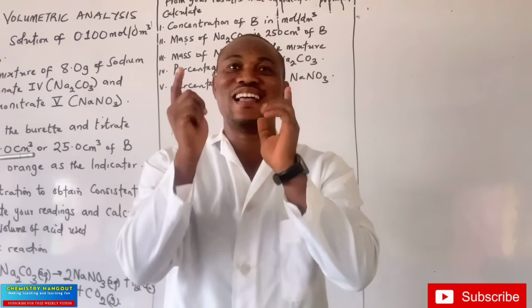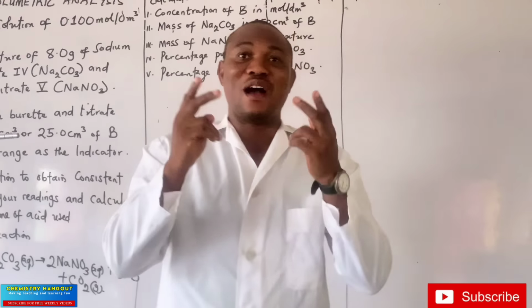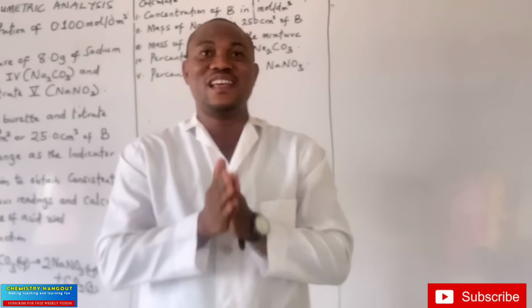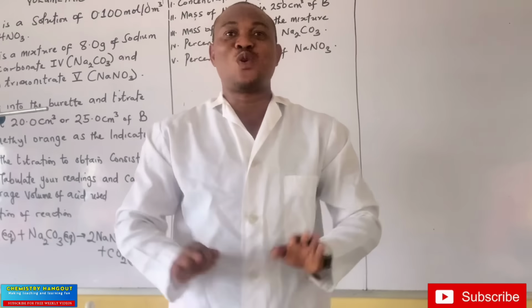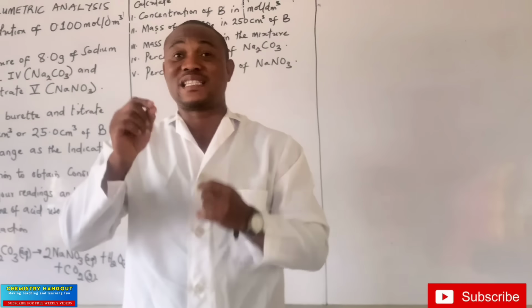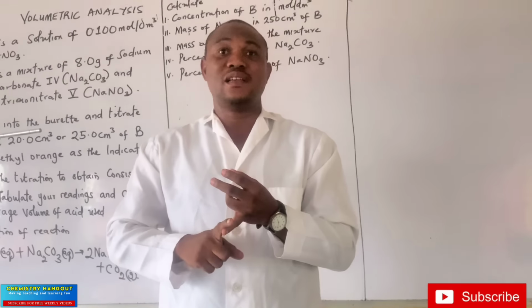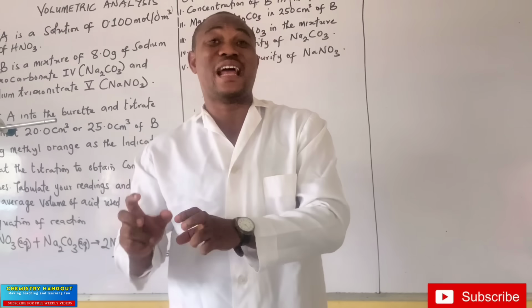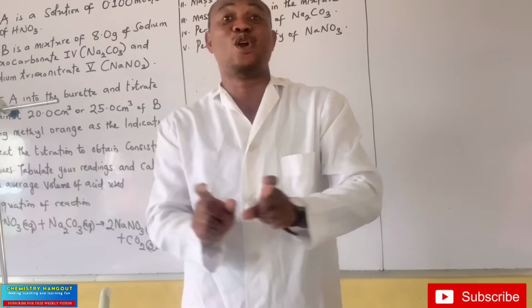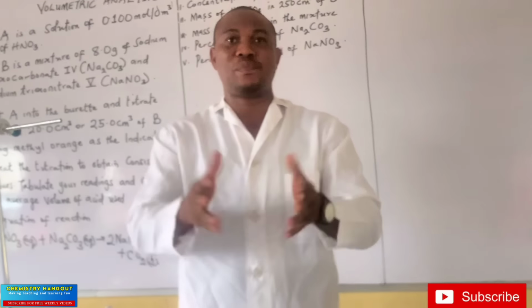And very important, if you look at the practical for this year NECO, we have two reagents that are acting as the base. But I've said that on the channel, there is nothing to worry about. The two cannot react. It is only one of them that will react, because the acid we are working with is HNO3, and we have both sodium carbonate and sodium nitrate. So the sodium nitrate there is just like an impurity, because the sodium nitrate will not react with HNO3. But we are going to give more updates on the WhatsApp channel, so please try and join.